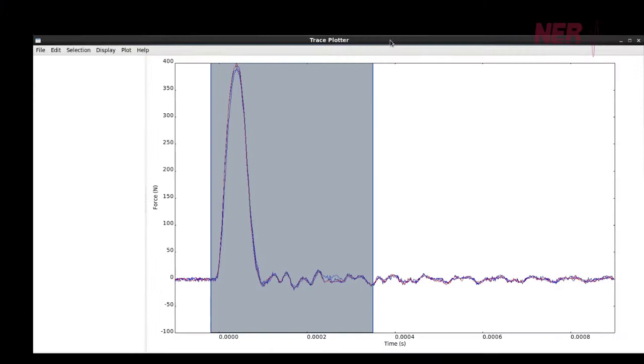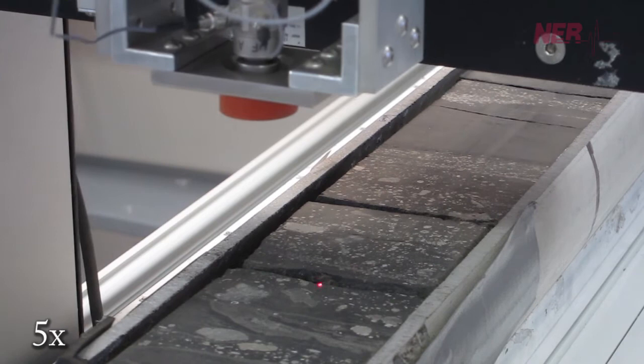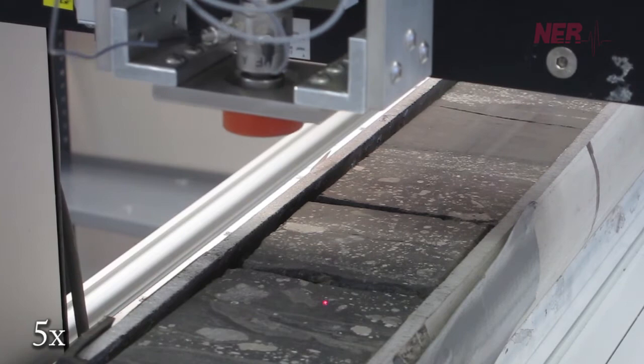When profiling slabbed core, it is common that the core contain fractures, vugs, and other flaws that need to be avoided in the measurement process. Prior to running the impulse hammer on the slab core, laser scanning can be employed to locate these features. Measurements at these locations will be skipped.